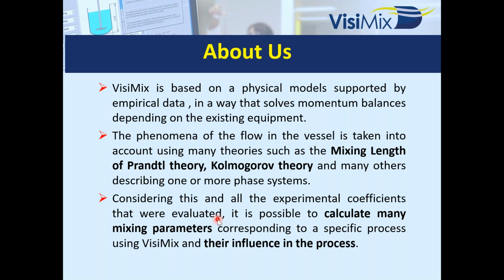We know the velocity of the flow. In order to be precise, we use known theories of mixing, but we apply them and modify them a little according to our experimental data, to the geometry that we are using, that is stirred vessels or pipe. We will release in half a year a pipe that will be flow chemistry.